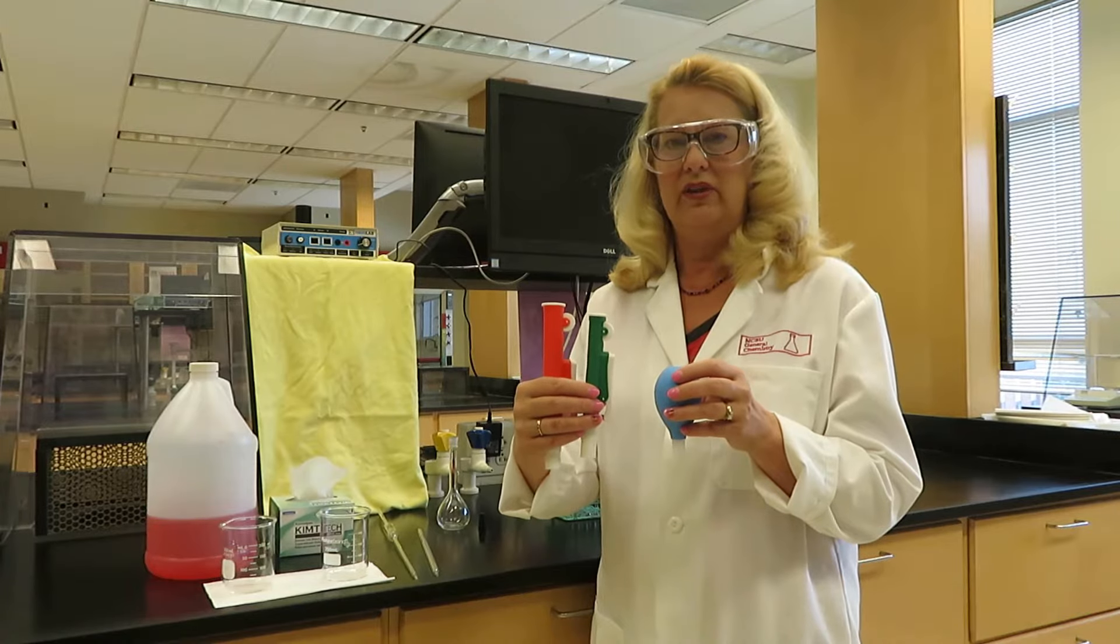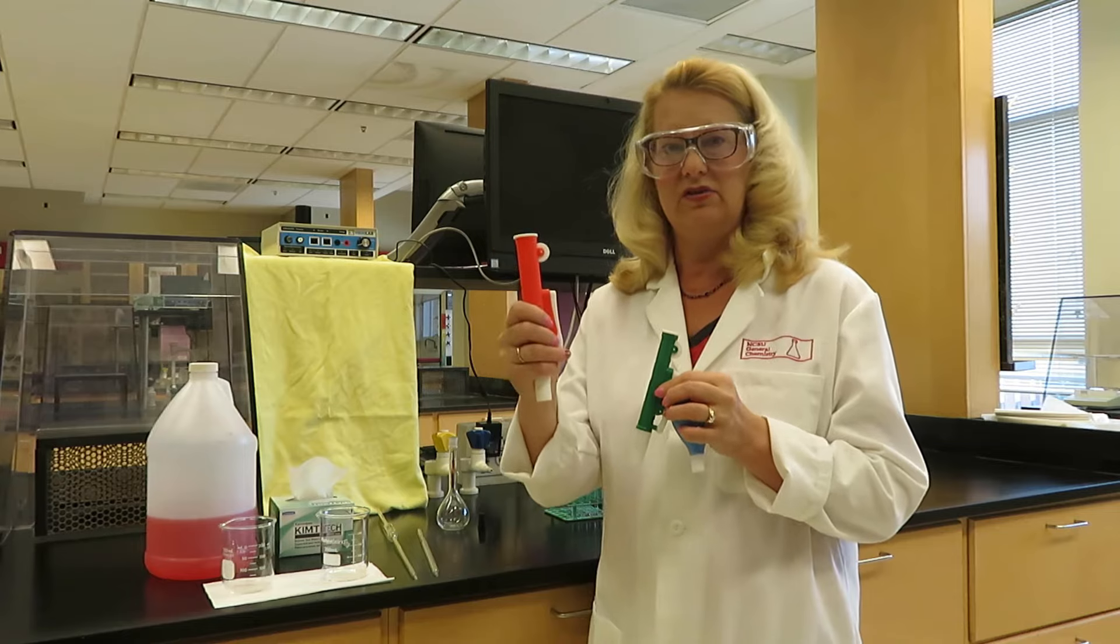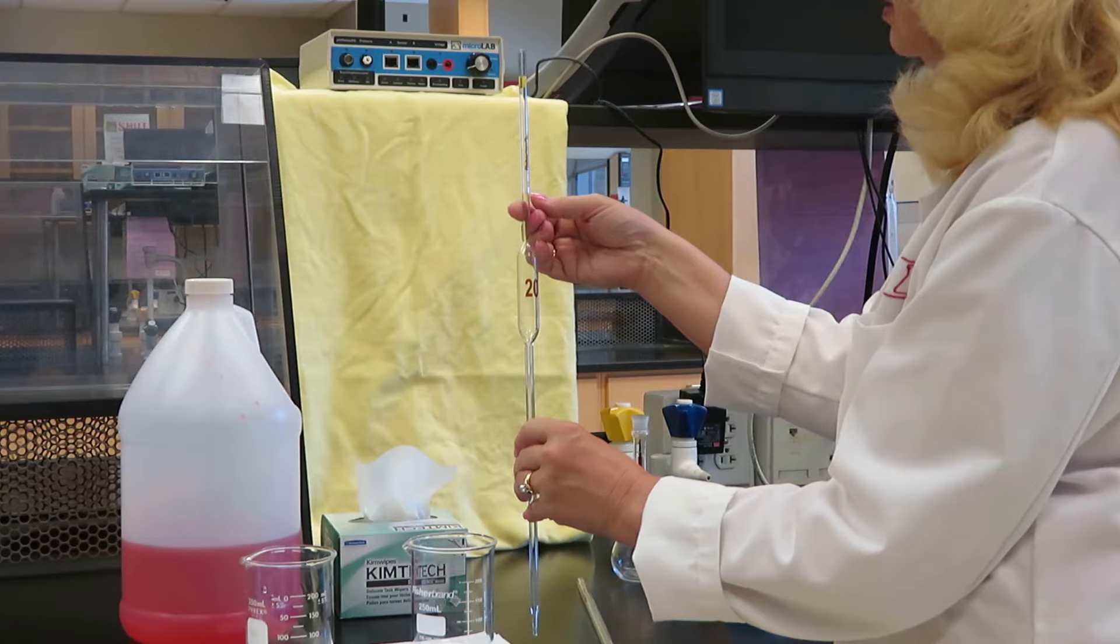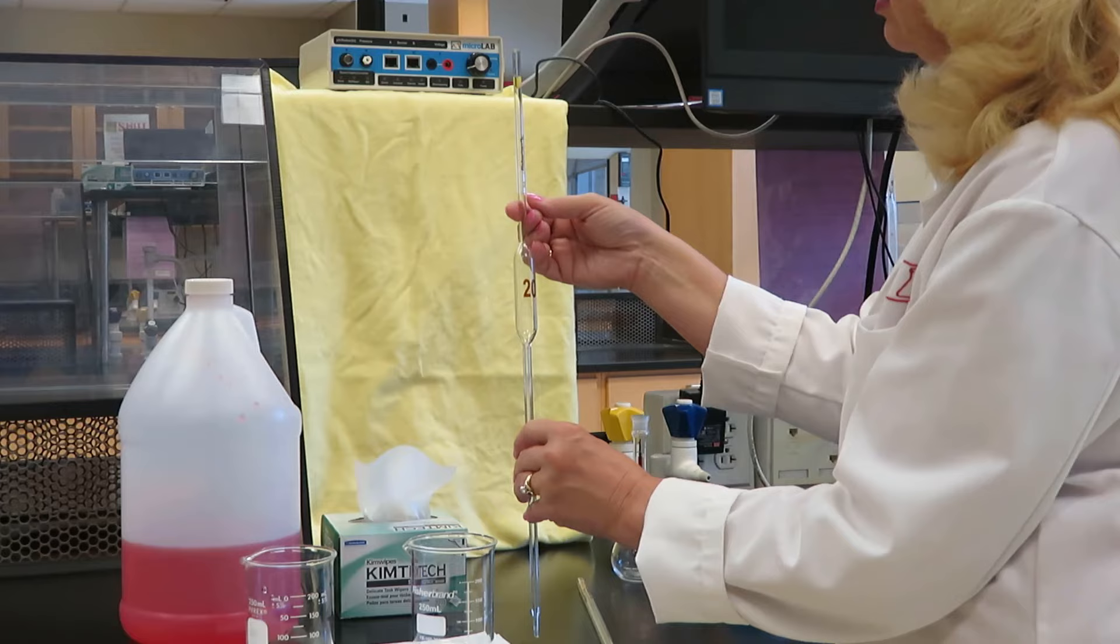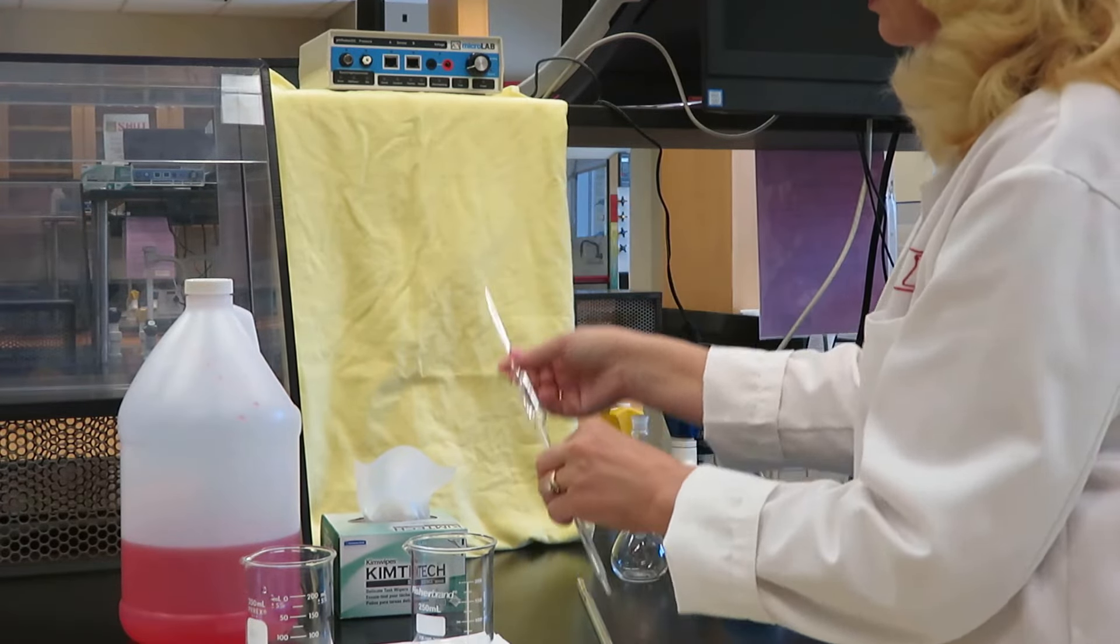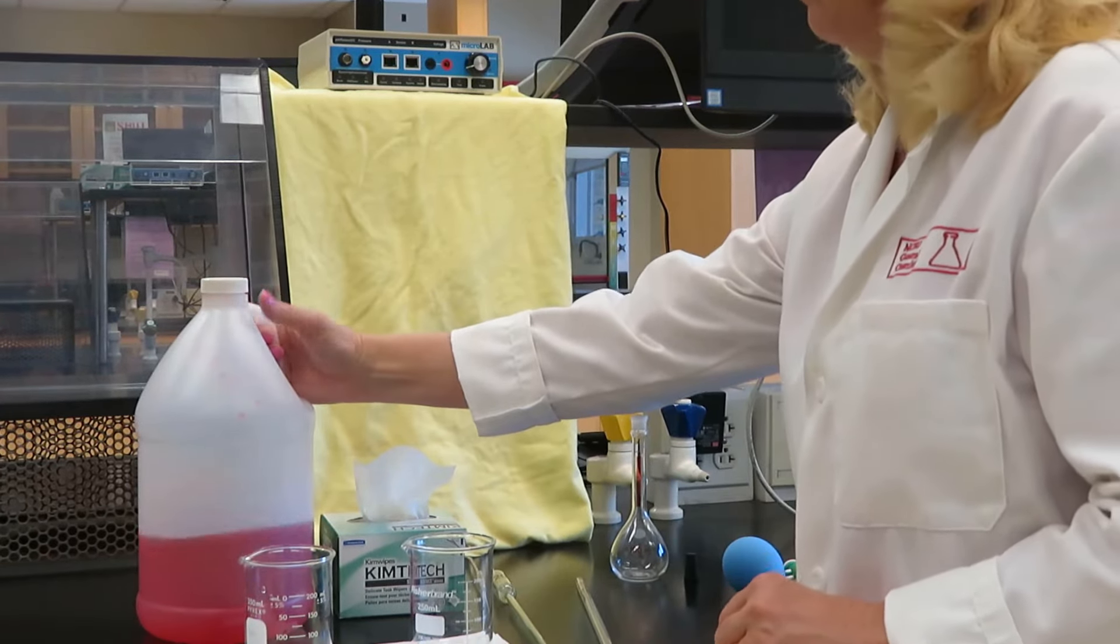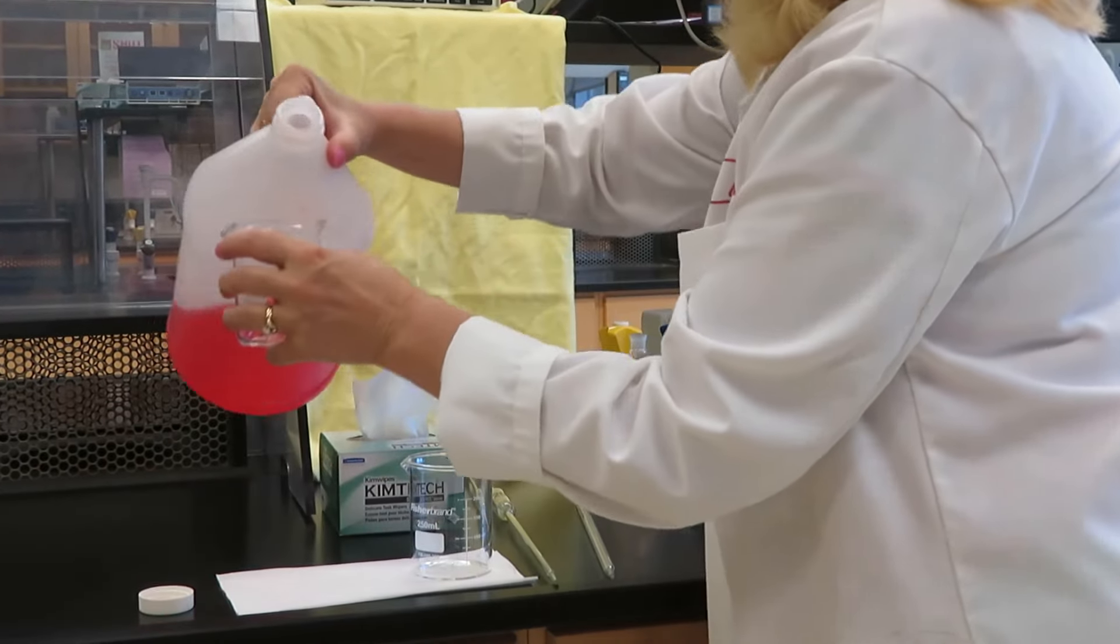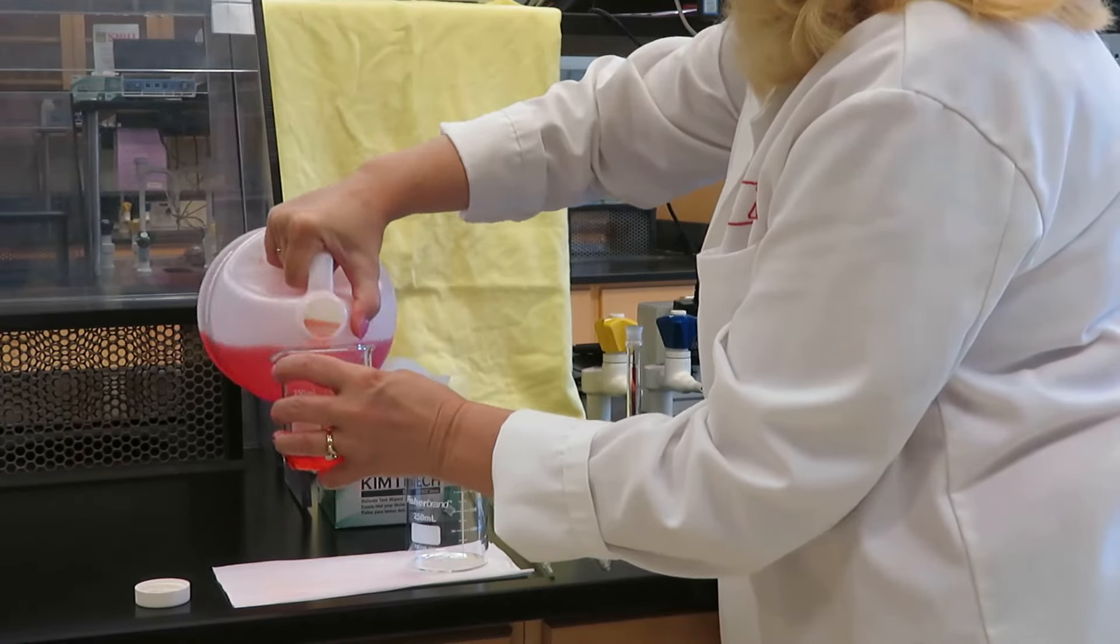Let's start by working with a 20 milliliter volumetric pipette, which means I'm going to use the red filler. The 20 milliliter volumetric pipette has a line right here, which indicates precisely 20.00 milliliters. I'll now demonstrate how to use this. First, never pipet directly from the stock bottle. I will take some of my solution and pour it into a clean, dry beaker.